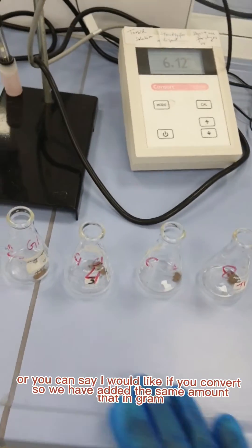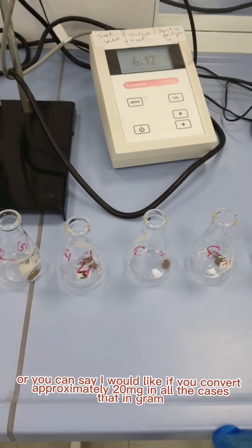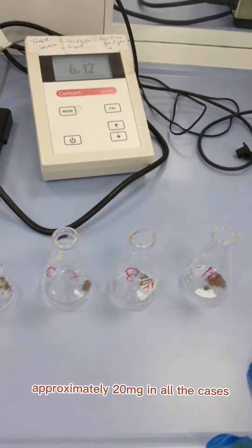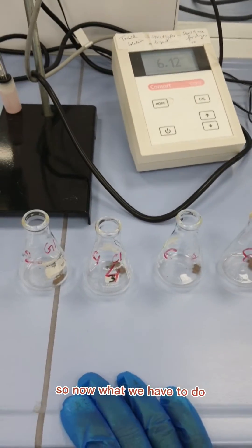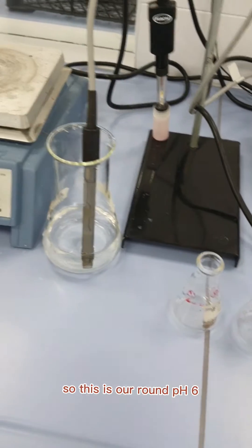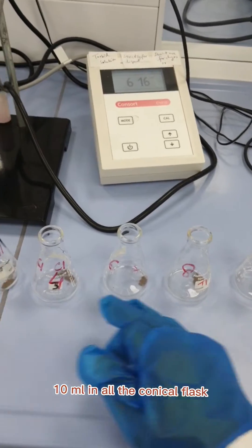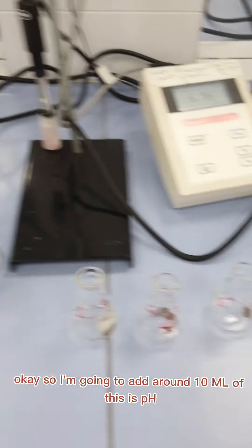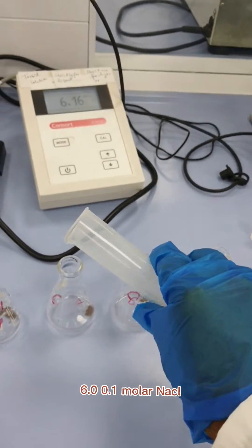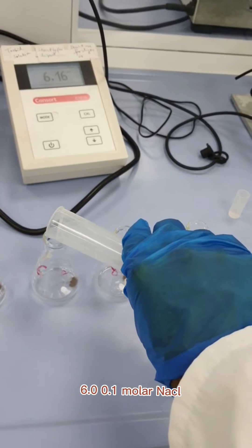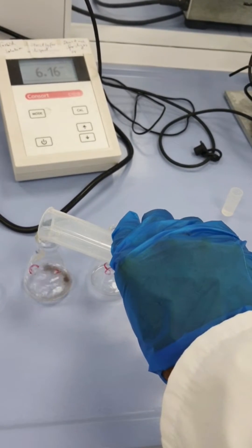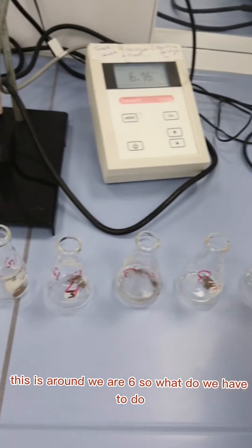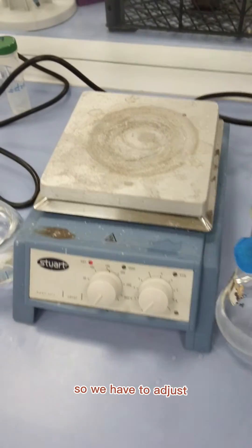We have added the same amount, approximately 20 milligrams in all cases. Now this is around pH 6, so what we will do is add 10 ml in all the conical flasks. I'm going to add around 10 ml of this pH 6, 0.1 molar NaCl.